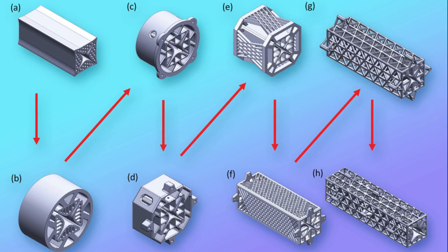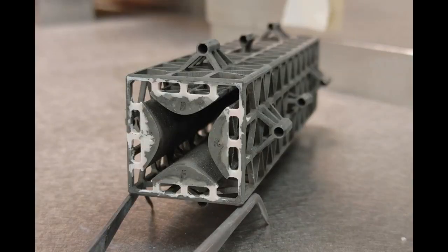To test the 3D printed quadrupoles, the team swapped them into a commercial system and found that they could attain higher resolutions than other types of miniature filters. Their quadrupoles, which are about 12 cm in length, are 1/4 the density of comparable stainless steel filters. In addition, further experiments suggest that their 3D printed quadrupoles could achieve precision that is on par with that of large-scale commercial filters. In the future, the researchers plan to boost the quadrupoles' performance by making the filters longer.